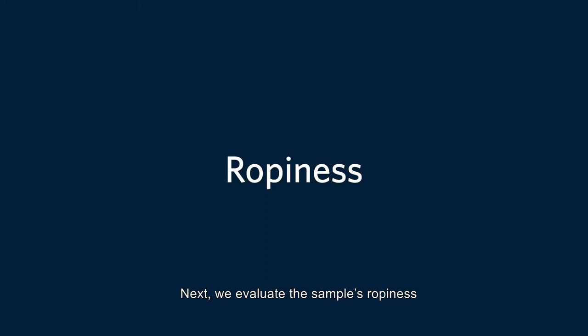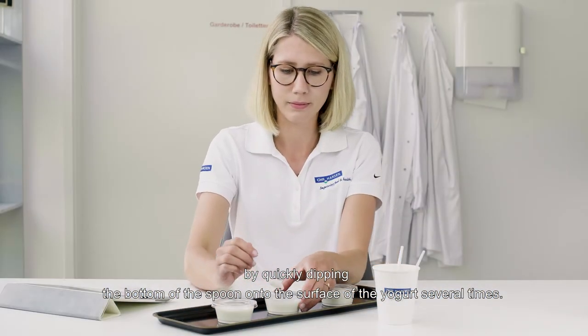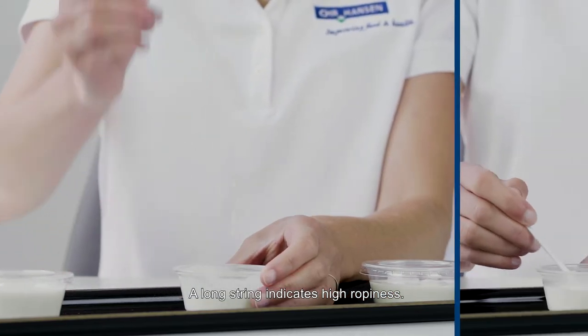Next, we evaluate the sample's ropiness by quickly dipping the bottom of the spoon onto the surface of the yogurt several times. A long string indicates high ropiness.